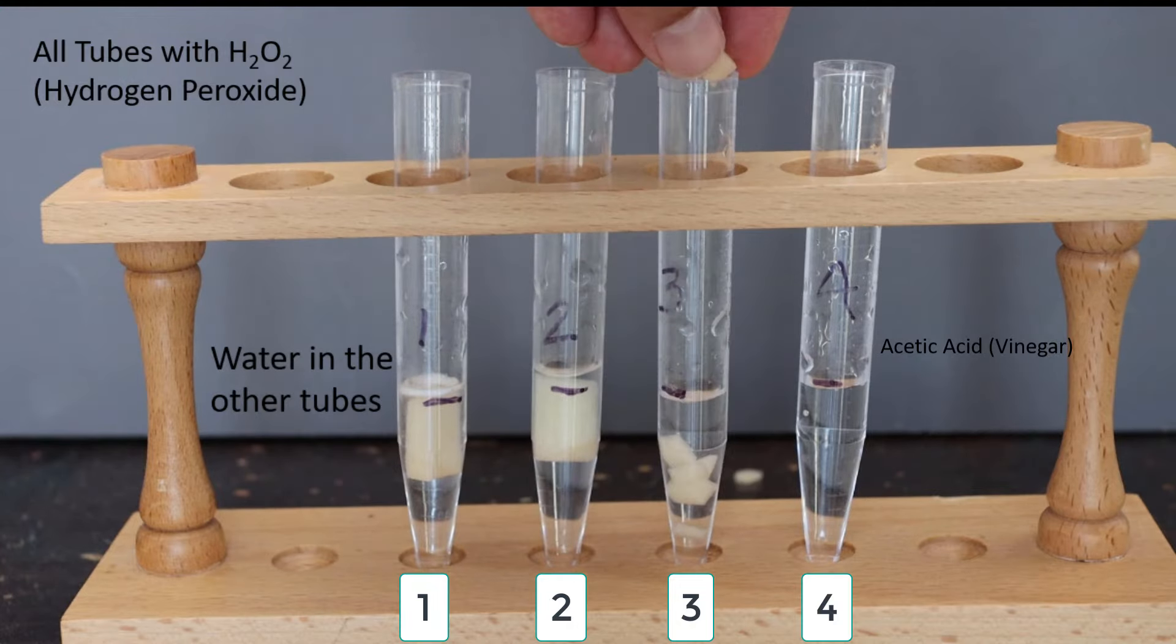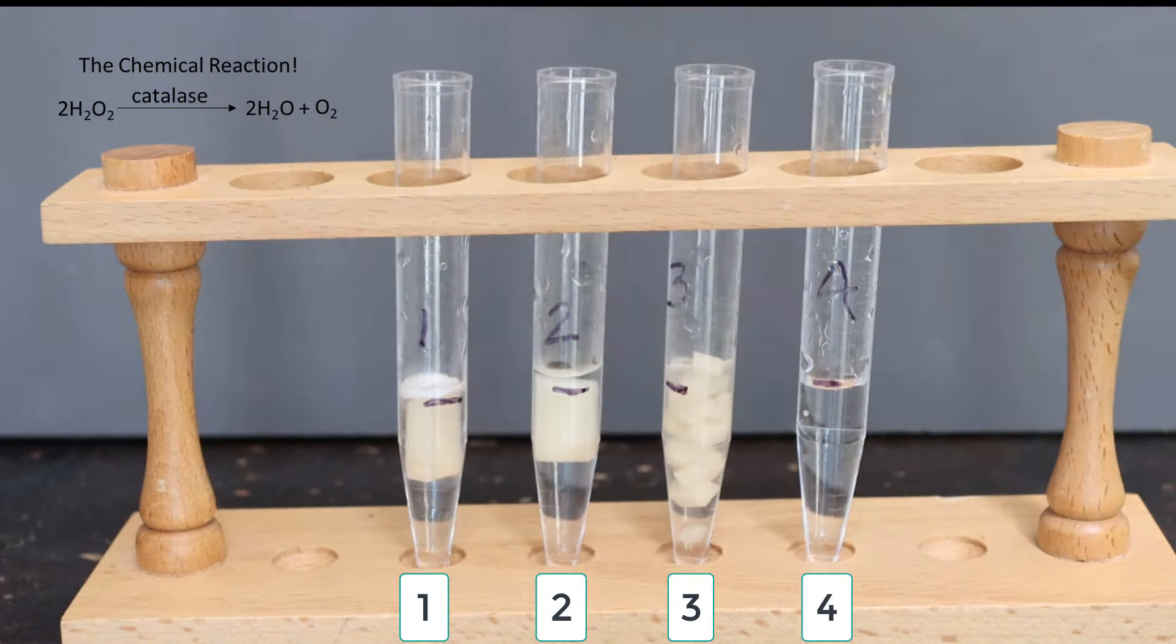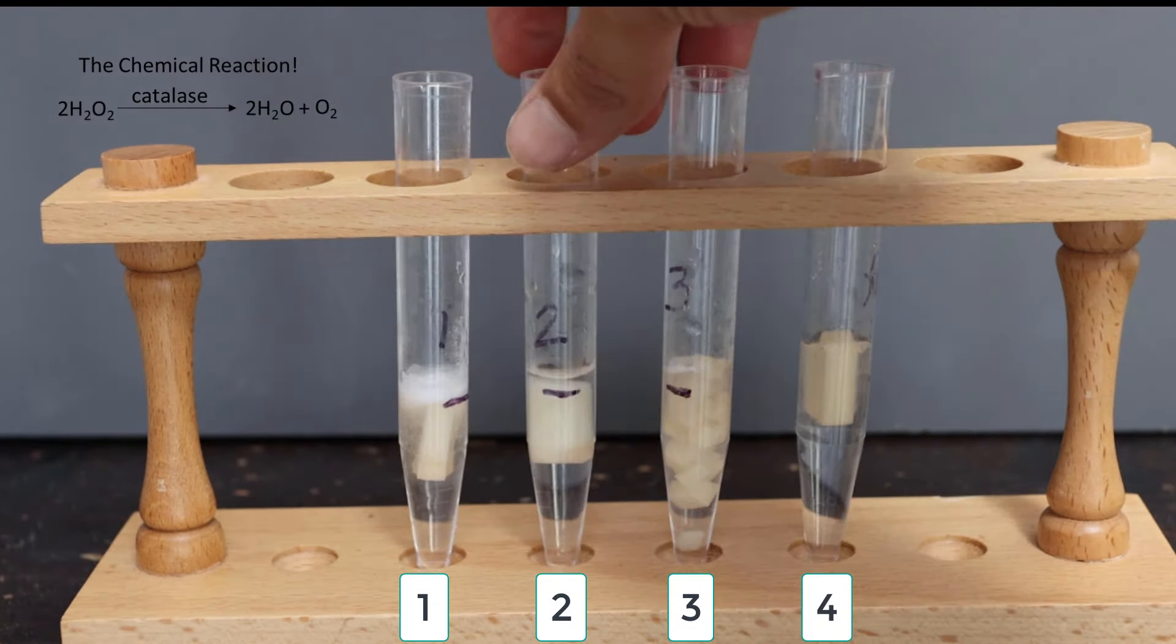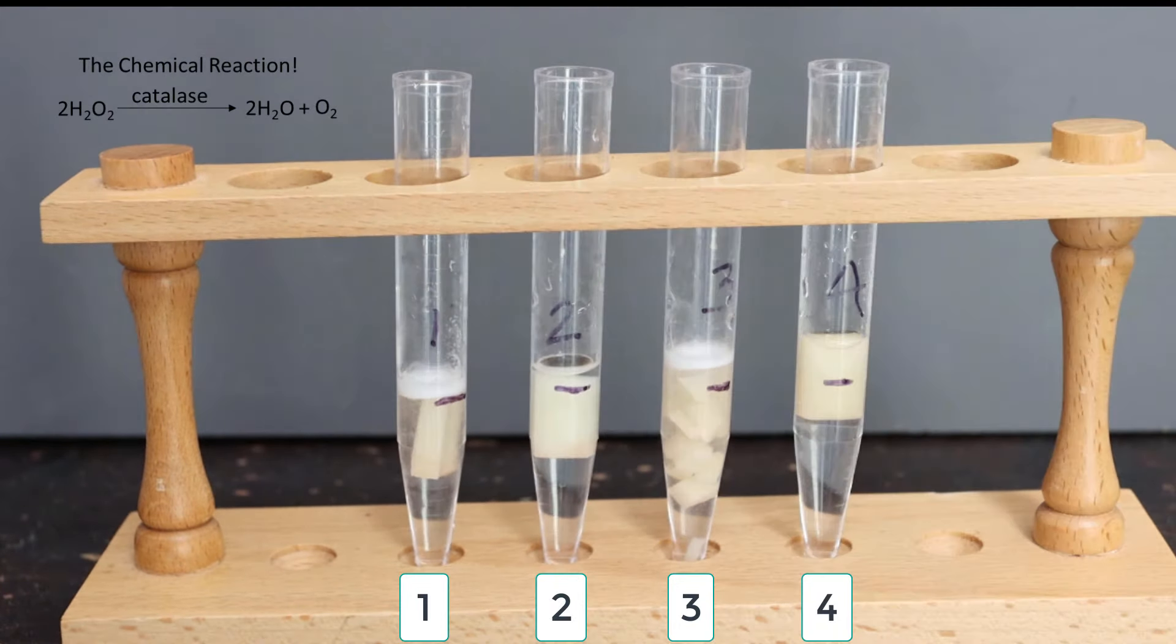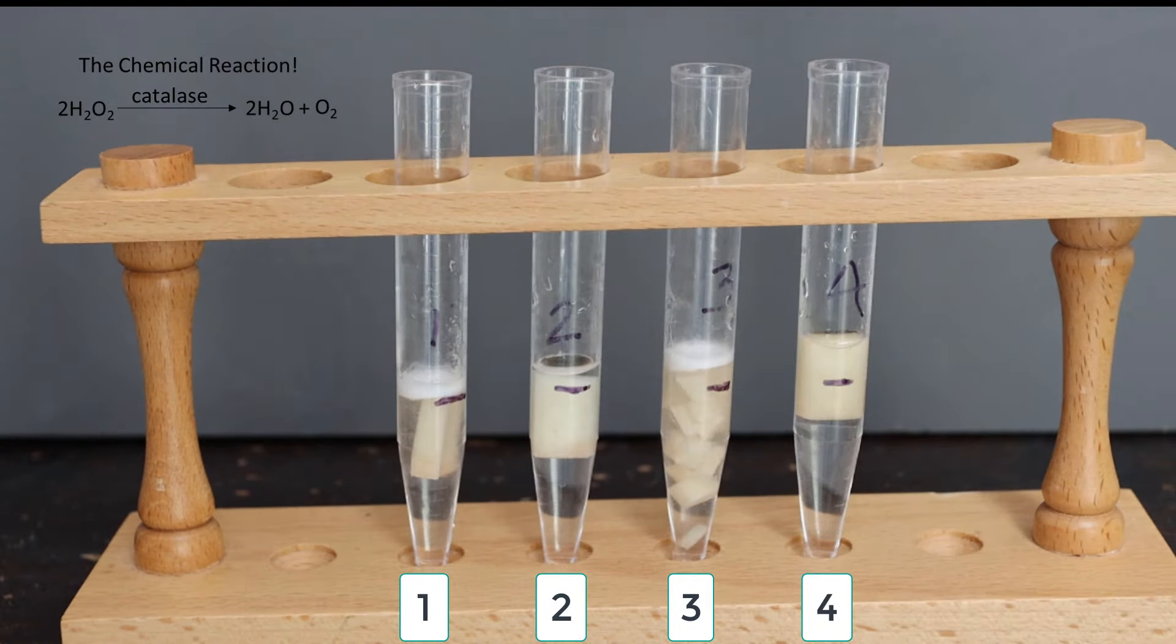Then we put our potatoes in. We have test tube one with a regular potato, test tube two with the one we boiled, test tube three has the potato we chopped up, and test tube four has normal potato but with acetic acid.